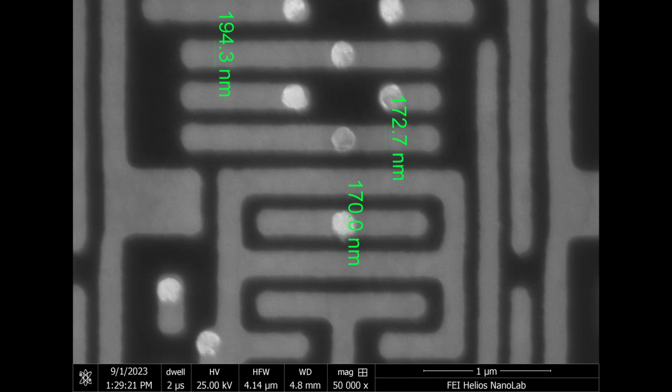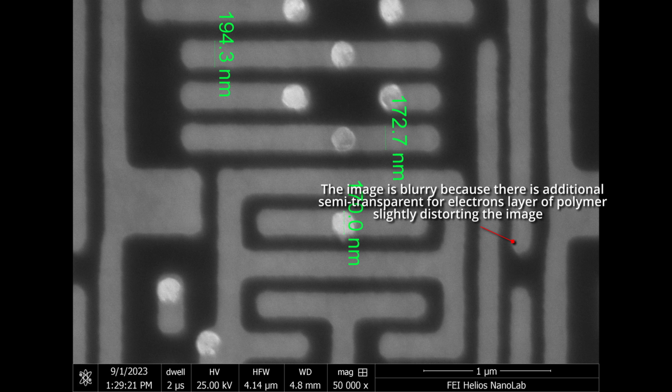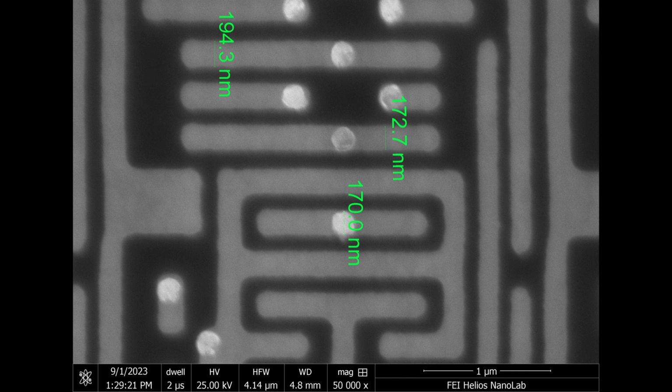The theoretical resolution of this microscope is about 0.1 nanometer. I've never achieved this value. However, with a well-prepared sample, for example gold nanoparticles on carbon, late at night when vibrations and electrical noise are minimal, I can approach about 2 nanometers resolution. This corresponds to magnifications of 500,000 times to 1 million times.